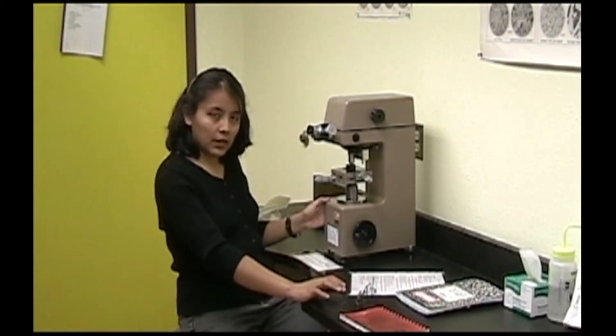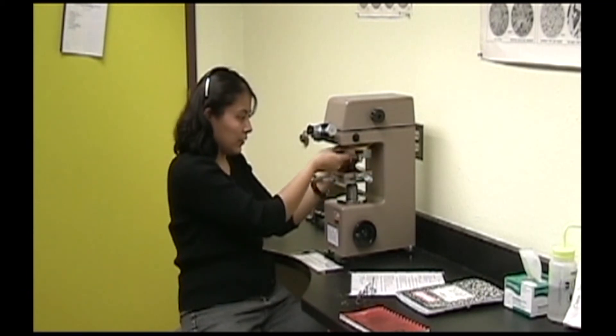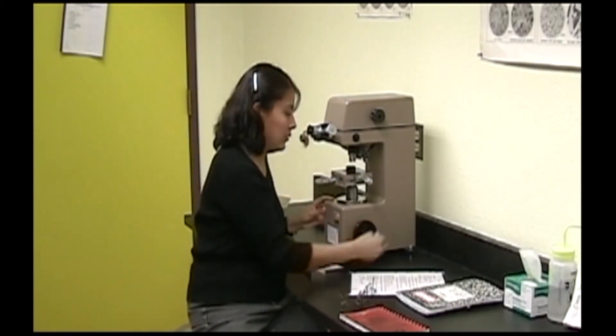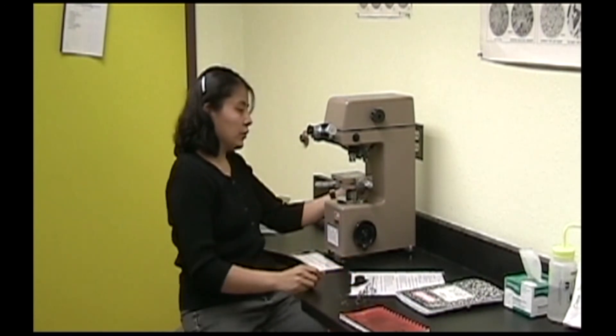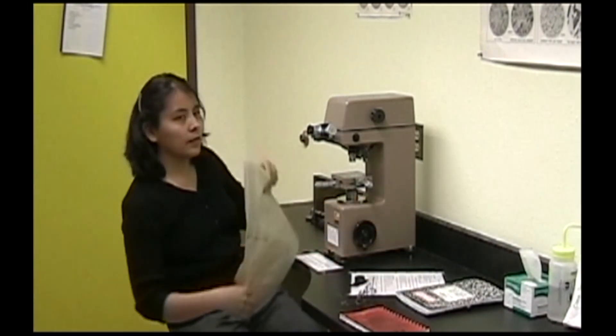When you are finished with your test, switch back to the 10x objective lens and then lower the stage. Remove your sample and turn off the machine. Sign out and cover the machine back up.